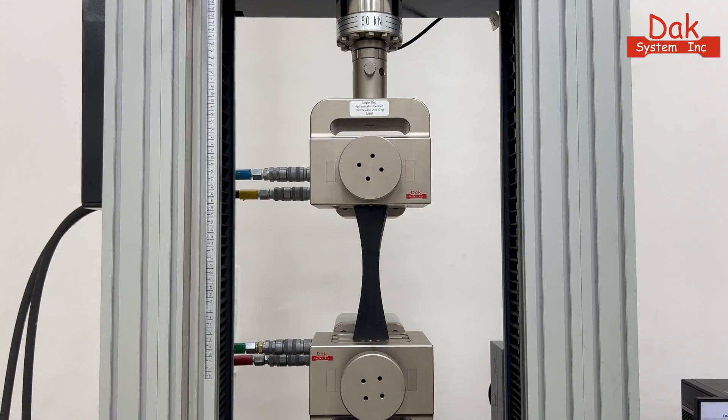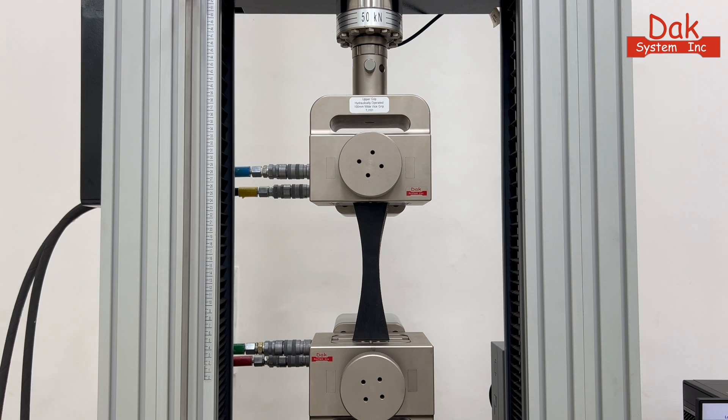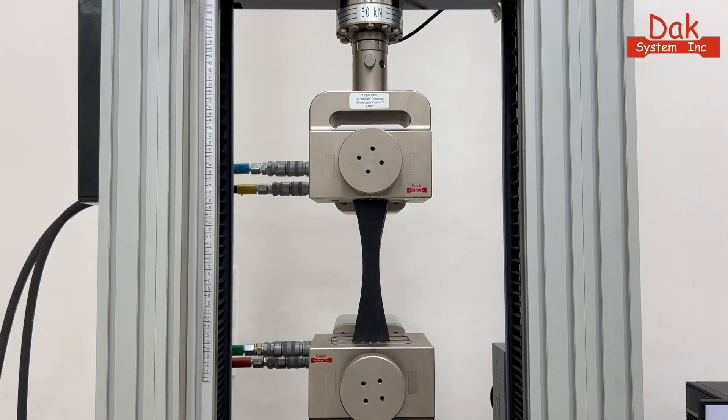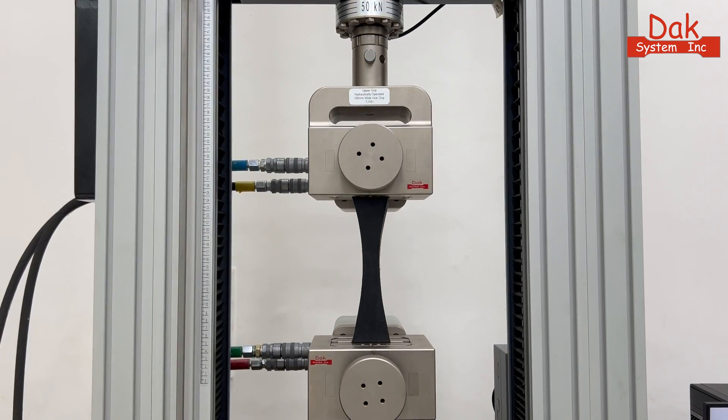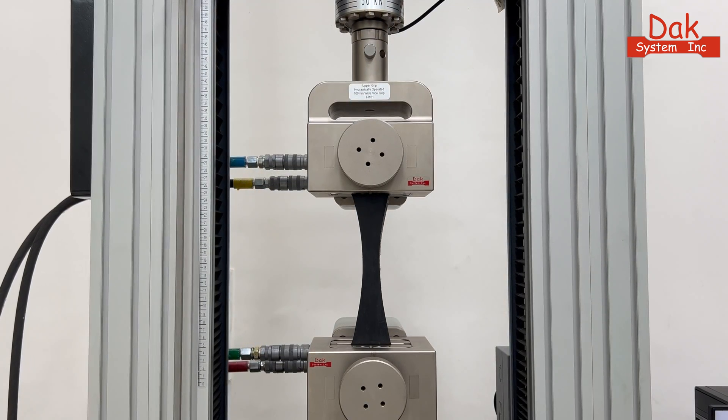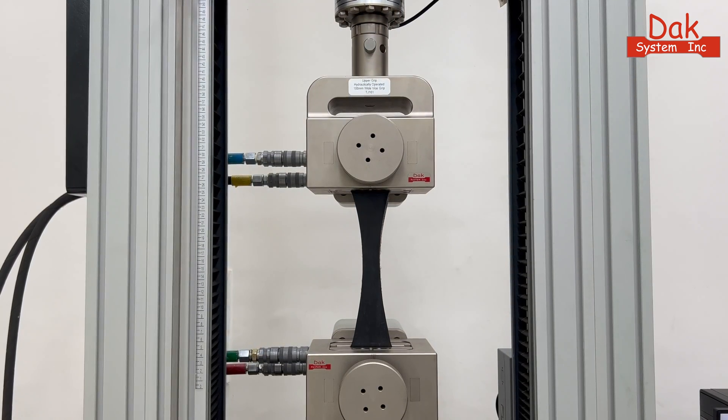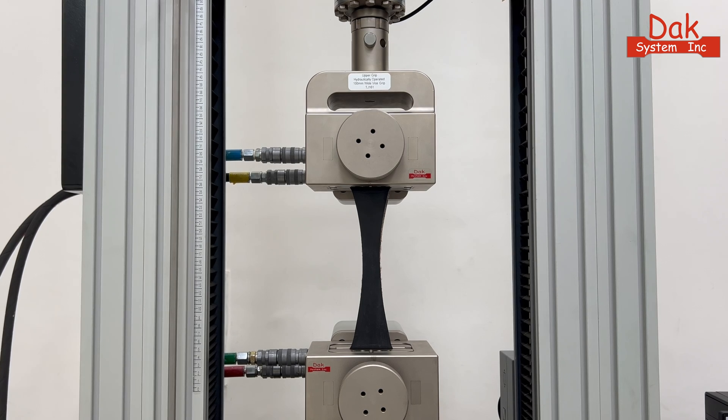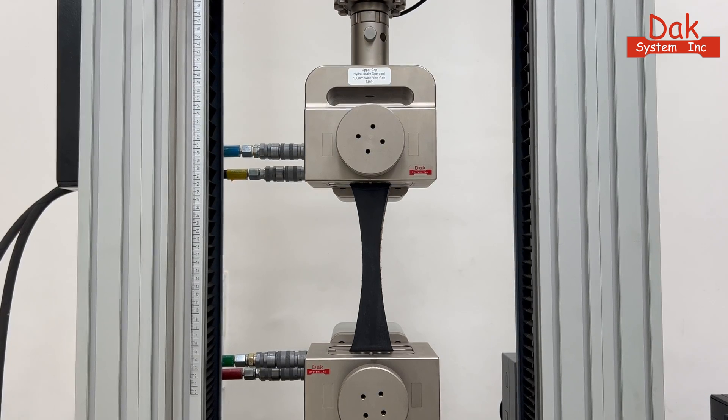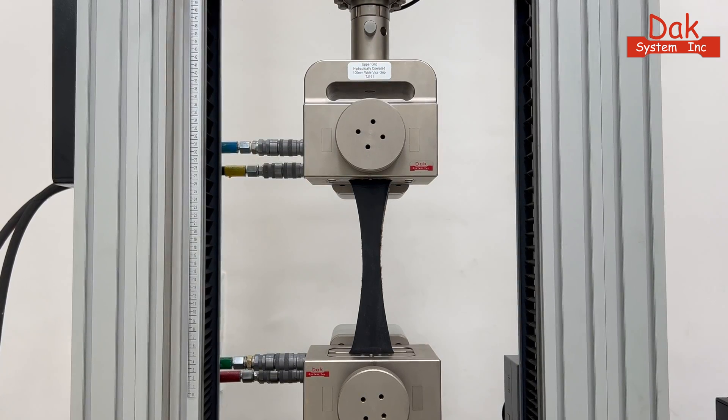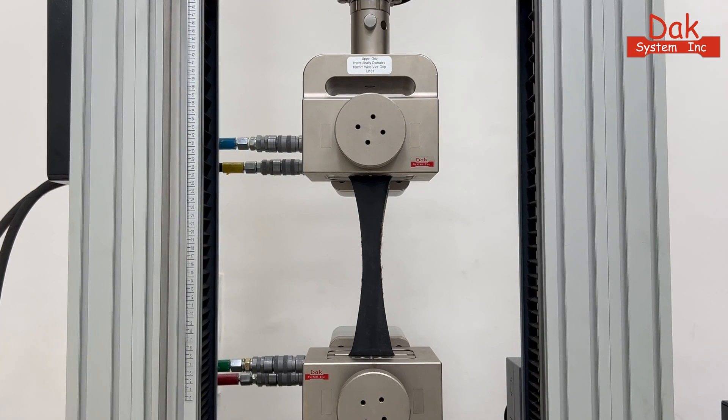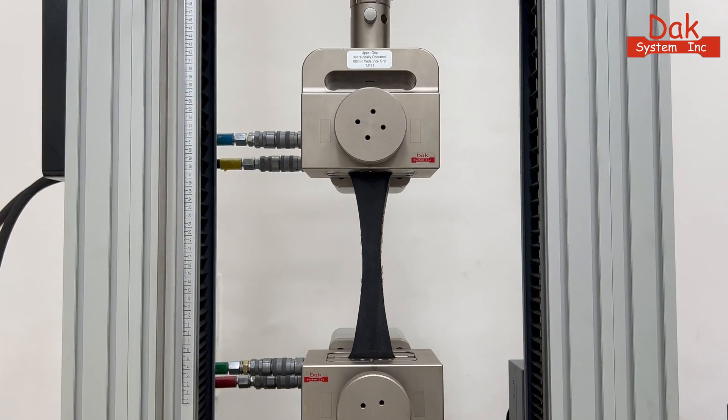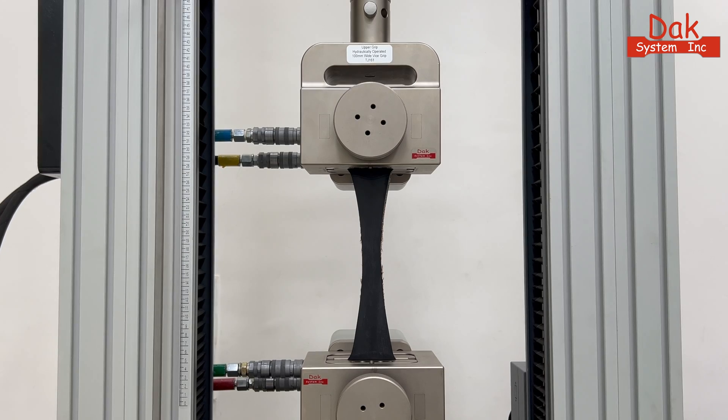As the test kicks off, the hydraulic vice action grips adjust their clamping force automatically in sync with the load, maintaining a secure grip on the specimen until it reaches its breaking point.